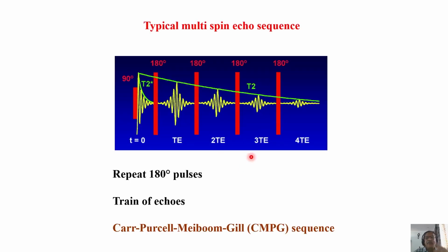But basically, remember, I gave you the idea about what is T1, what is T2, a conceptual understanding, what is a growth function, what is a decay function, everything we discussed. If you want to measure T1, you have to adopt the inversion recovery method, that is the 180, tau, 90 sequence. Vary the tau value and keep on collecting the signal as a function of tau, and then fit the intensity of the peaks into that growth function.